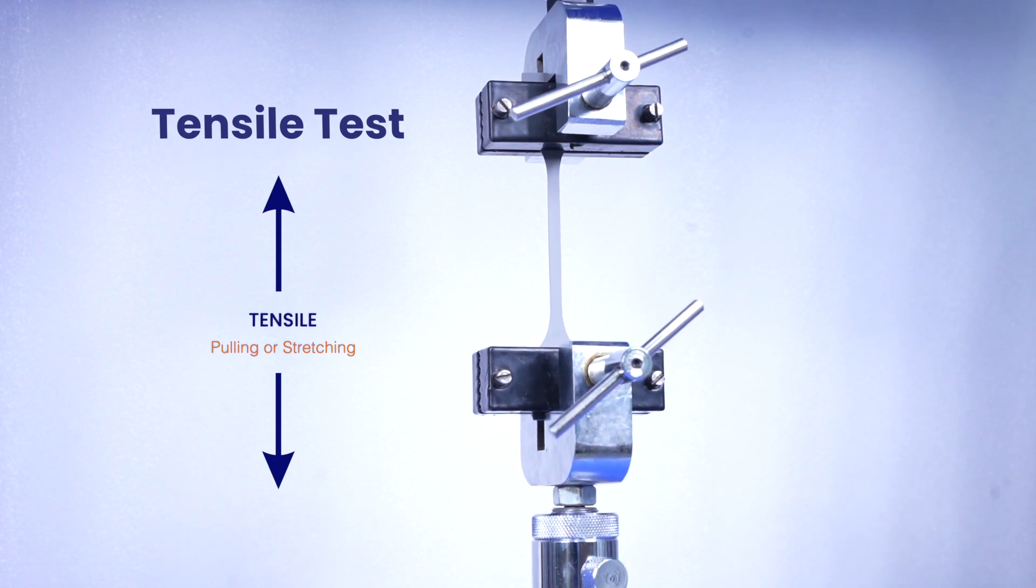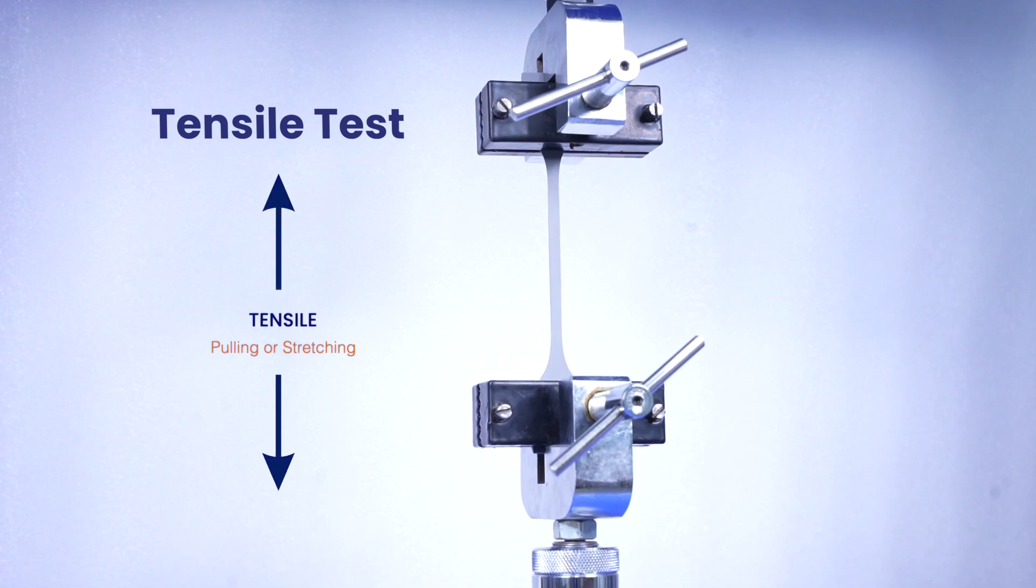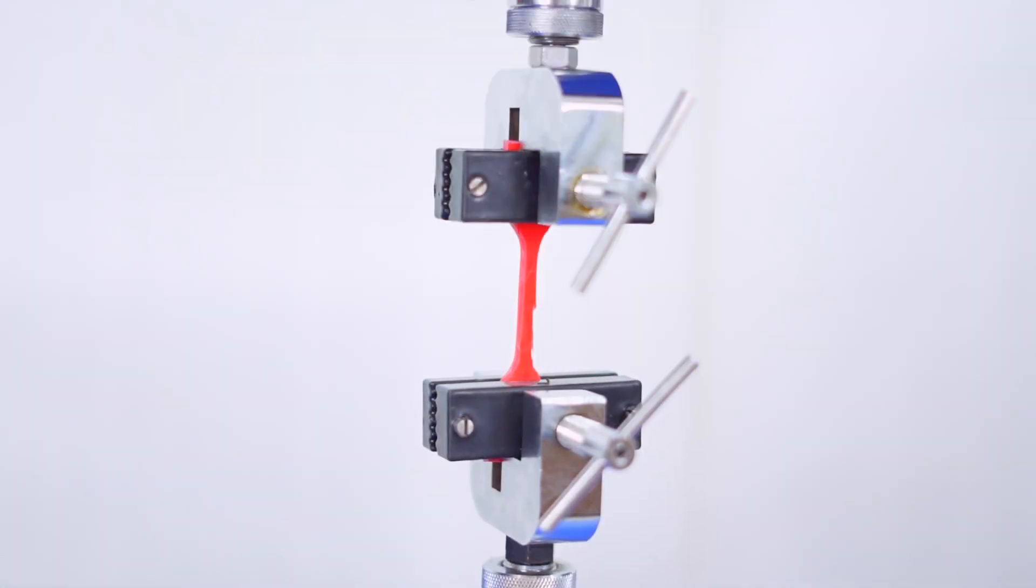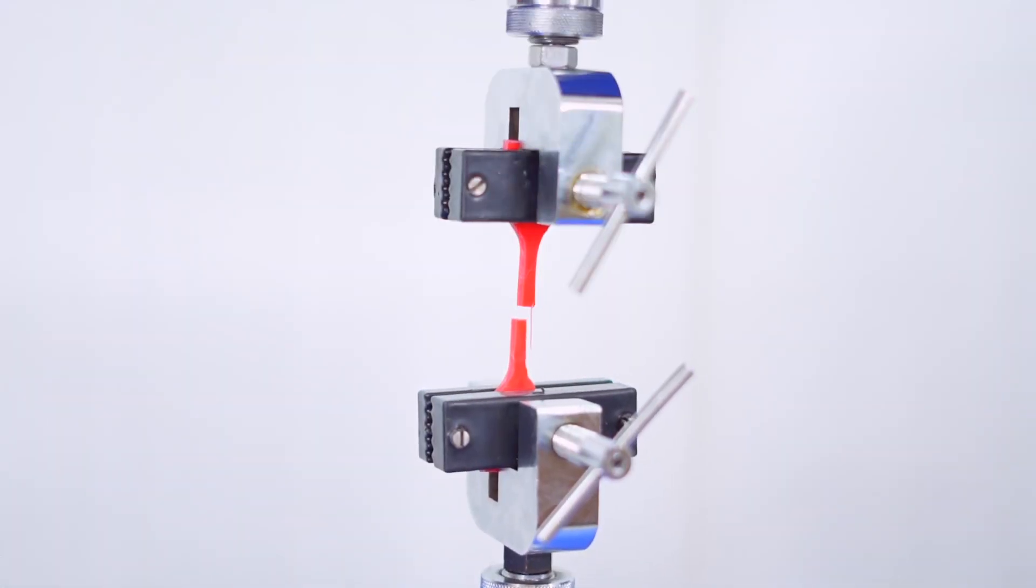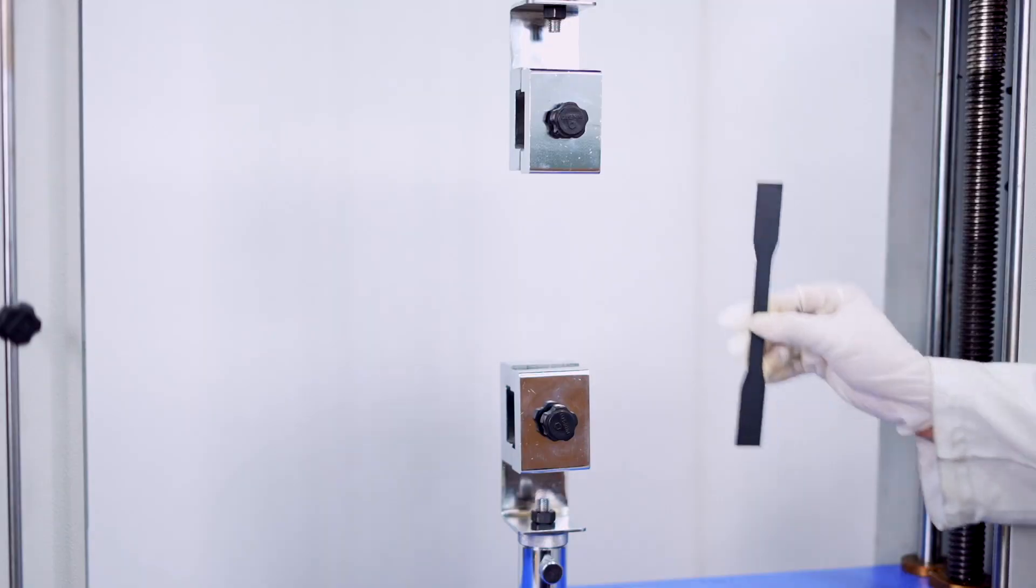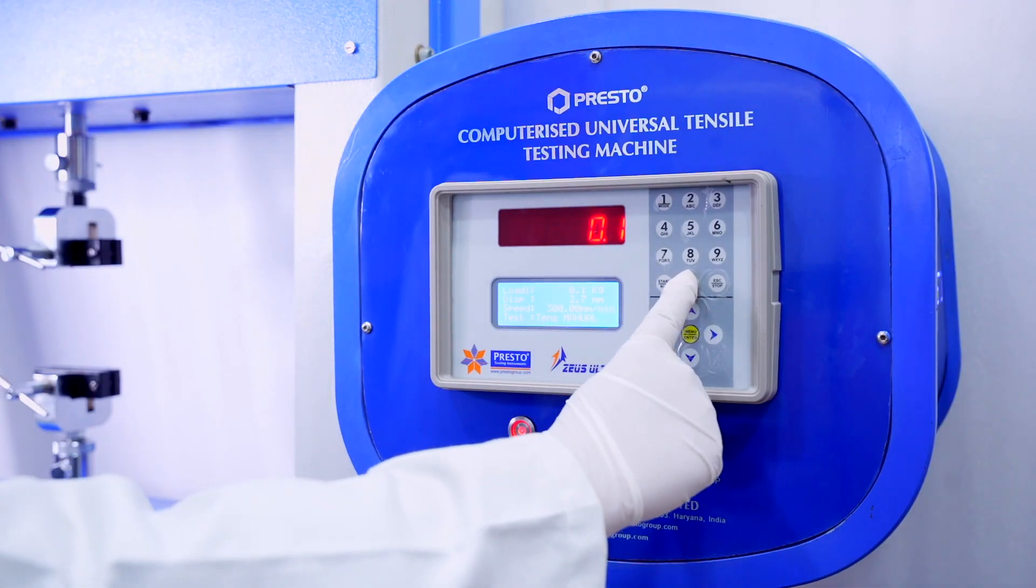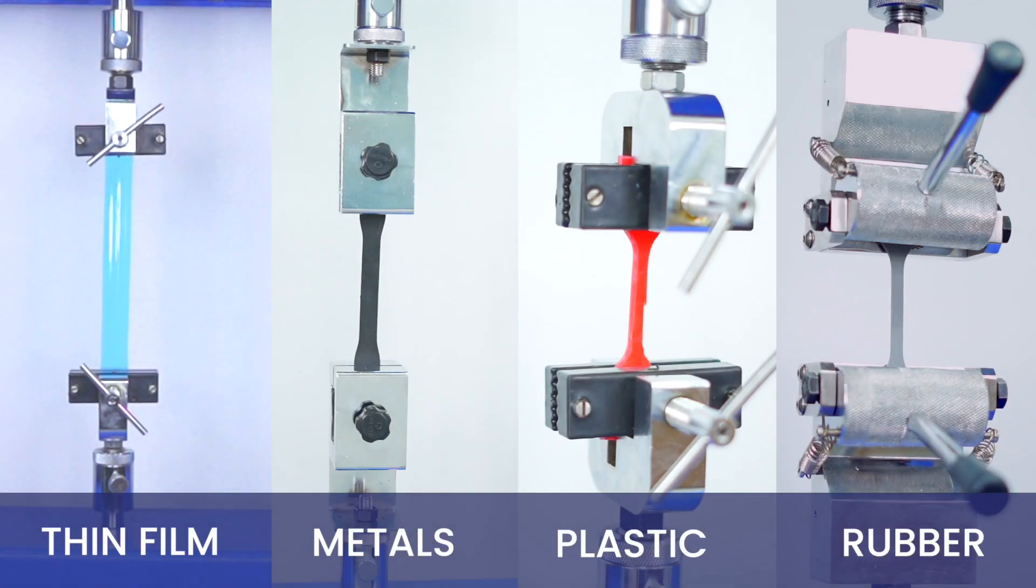The test provides valuable information about mechanical properties. This test is particularly important in industries such as manufacturing, construction, and materials engineering, where the tensile strength of materials is a critical factor in product design.